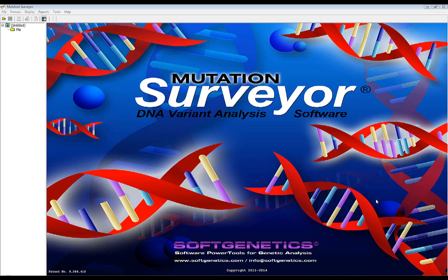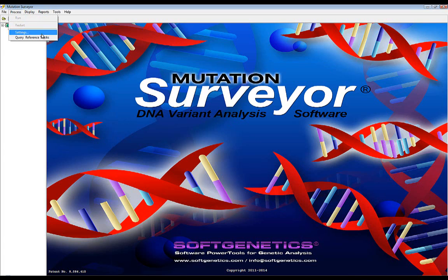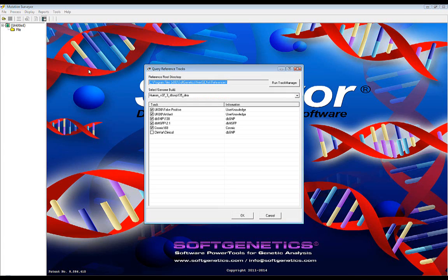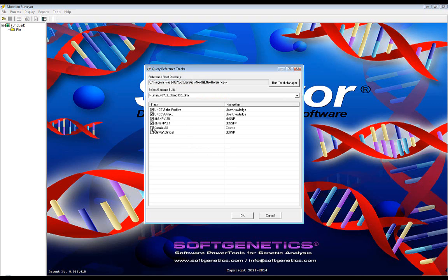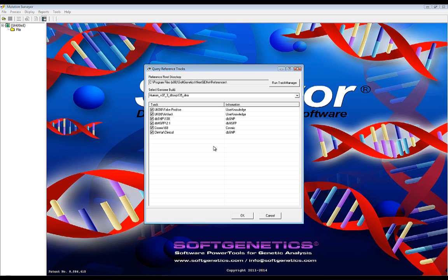After annotation databases have been uploaded, they will be listed in the Track Query option found in Process Query Reference Tracks. You may select which databases you wish to query by checking the box to the left of the database name and clicking OK. In this project, I have imported and selected four external databases: COSMIC, dbSNP, CLINVAR, and dbNSFP. I have also selected two custom databases of artifacts and false positives. The process of constructing these databases will be covered later in the video.